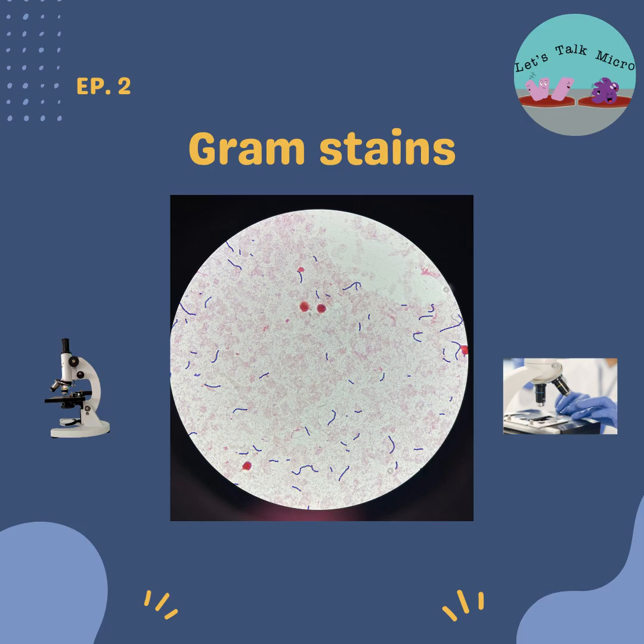But if you see gram-positive cocci in clusters, you start thinking staph. If you see gram-positive cocci in chains, you're thinking strep. Of course, if you see yeast, you're thinking about Candida or other fungi. So it definitely gives the provider an idea of what they might be working with based on the gram stain.